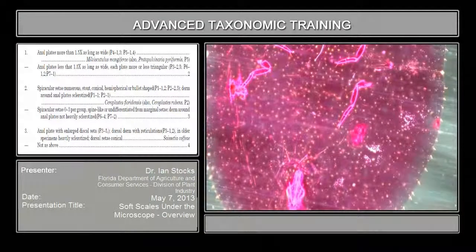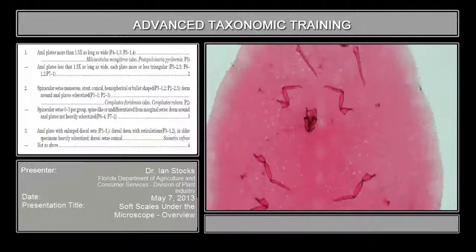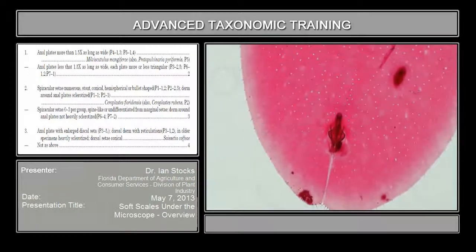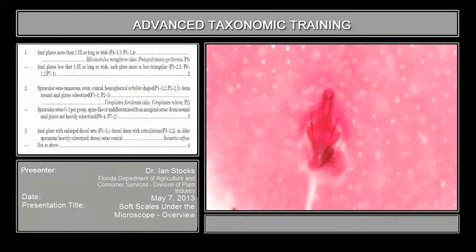So before we move to the key, let's just quickly put in another species and draw some comparisons. Pick up the one for Coccus hesperidum. We'll go back to 10x. Are you all set up with that slide? You can see it at 4x, but we'll go ahead and go to 10x. If you can go towards the posterior of the specimen and look for the anal plates, find them and go to 10x. Now we're on plate 7.